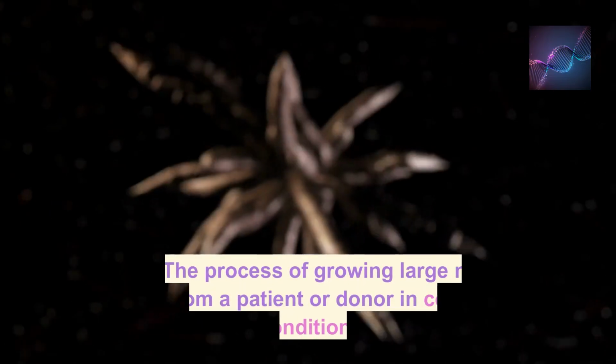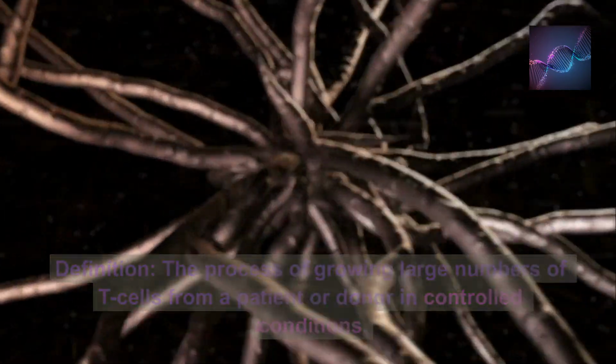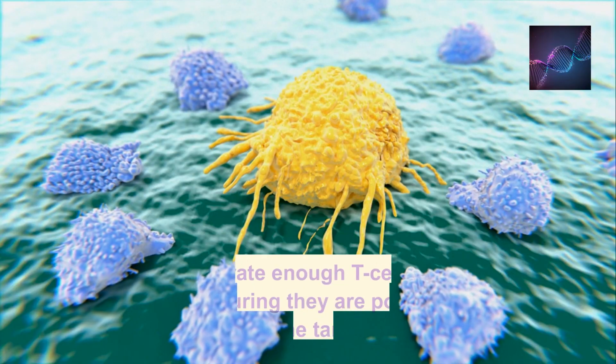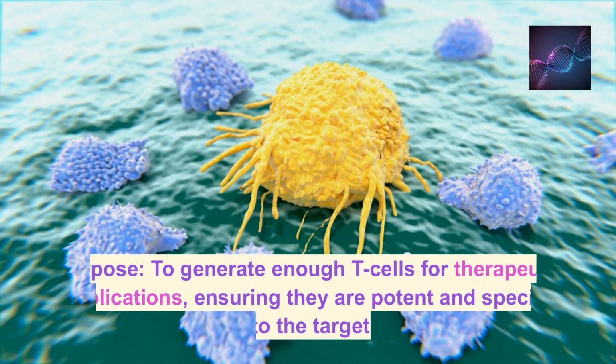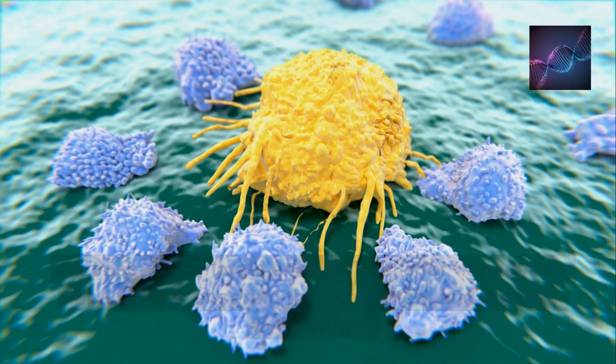1. What is T-cell expansion? Definition: the process of growing large numbers of T-cells from a patient or donor in controlled conditions. Purpose: to generate enough T-cells for therapeutic applications, ensuring they are potent and specific to the target.